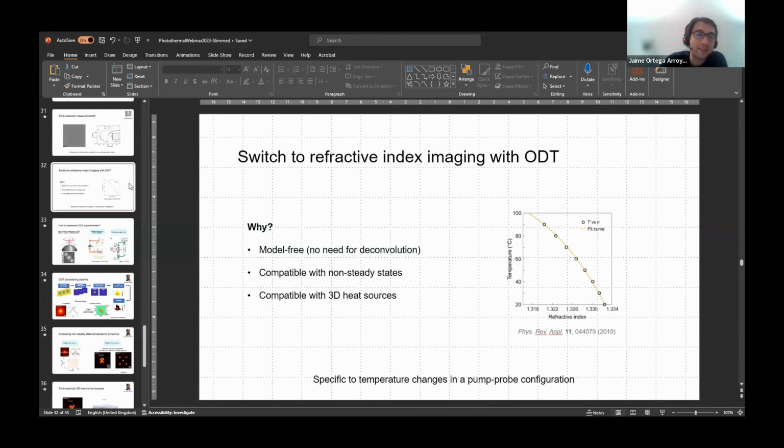So yes, this is correct. This works quite nicely for most of these scenarios because we're working in aqueous media. So for most cases, this is a kind of homogeneous state. Even when you work with cells, cells are mostly composed of water, so the main thermo-optical material would be water. And you're right, the moment you start introducing interfaces, things can become a little bit challenging. But it turns out if you work with a glass interface on the bottom and water on top, as long as you focus on the areas that are above the glass, the whole refractive index reconstruction works quite well. You can actually impose certain conditions such that when you try to retrieve your refractive index, you only consider the areas where this is homogeneous.